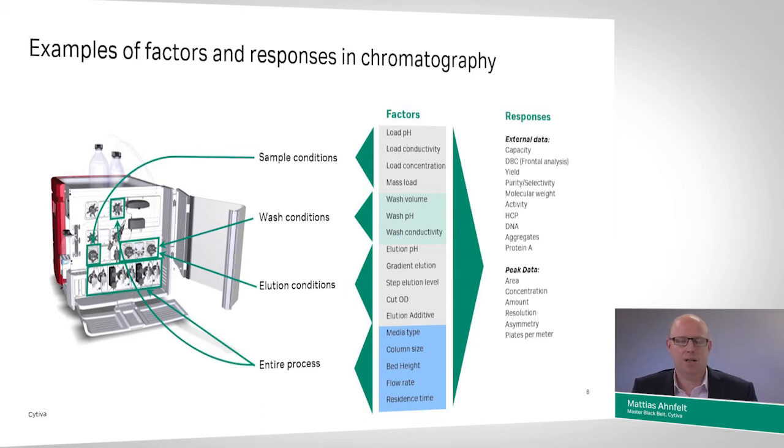chromatography unit operation. At the same time, we should never forget about the previous knowledge we have of our unit operations. And if we go into DoE for downstream processing, we shouldn't forget about the value of a gradient run, for instance, to learn about how our protein purification process responds to a pH or a salt shift.